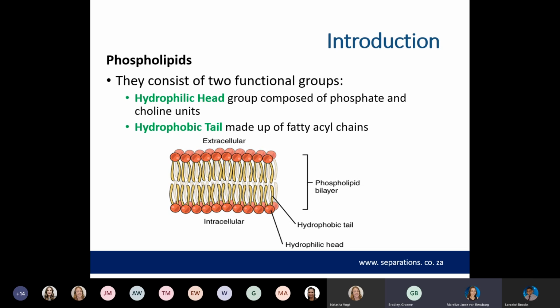One of the most important interferences in biological samples are phospholipids. They can greatly affect your MS response and many analytes analyzed during MS. They're very difficult to remove because of the phospholipid bilayer, which is hydrophobic and hydrophilic in nature. And they are a major constituent in cell membranes. So they're quite abundant when you're working with any biological sample, such as serum, plasma, or even plant samples.